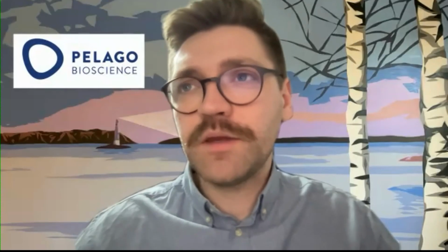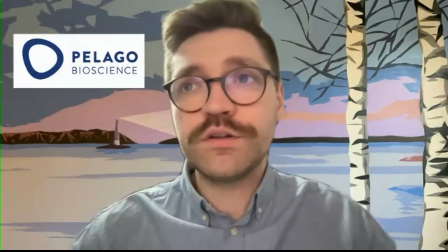Yeah, that sounds good. Thanks, Pete. We have another question coming in: have you considered combining the CETSA experiment with a higher throughput detection system, such as TR-FRET, to test more compounds, or are there limitations?